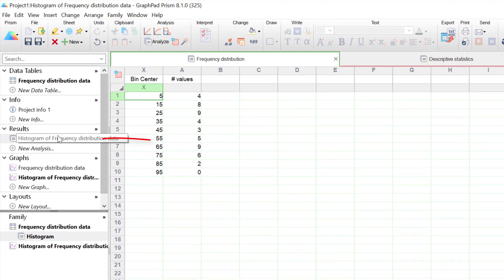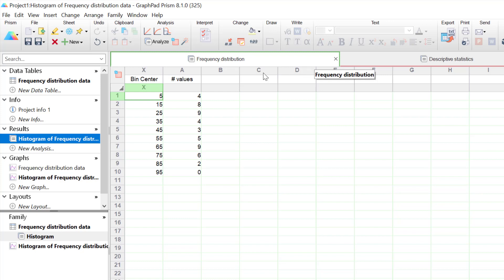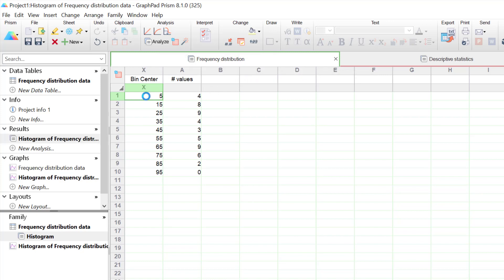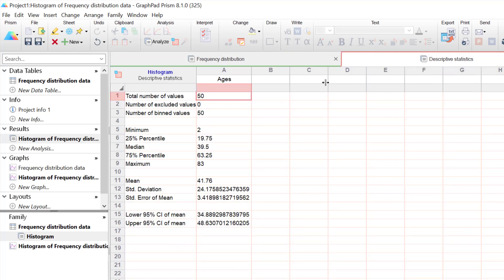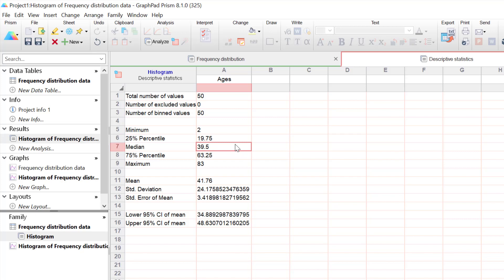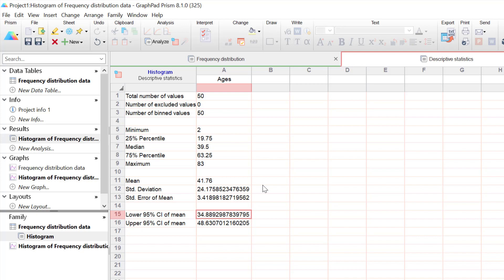The first thing you'll notice is a new result sheet has been created, split into two parts. The frequency distribution part contains the bin centers and the number of values in each bin — for example, bin center 5 represents values between 0 and 10, and our dataset has four values in that range. The second part is called descriptive statistics, giving you the n number, minimum value (which is 2, so 2 years old), the 25th percentile, the median, the 75th percentile, the maximum value, the mean, standard deviation, standard error of the mean, and the 95% confidence intervals.